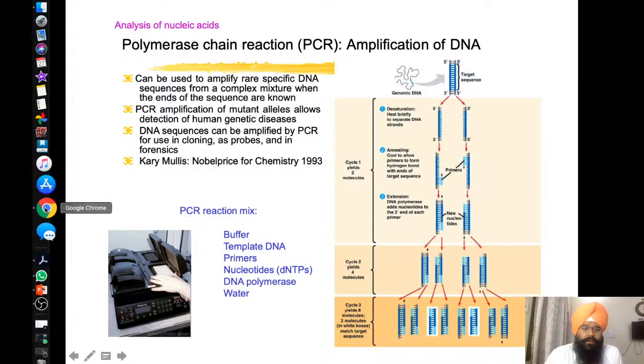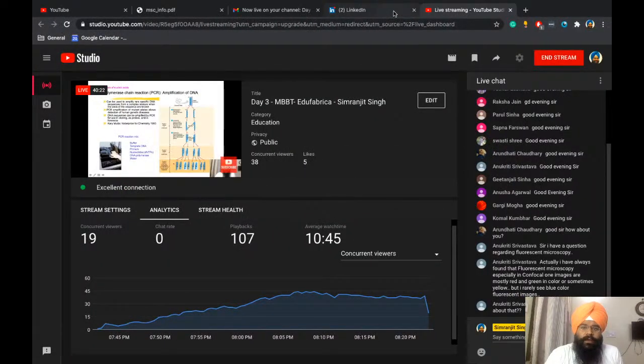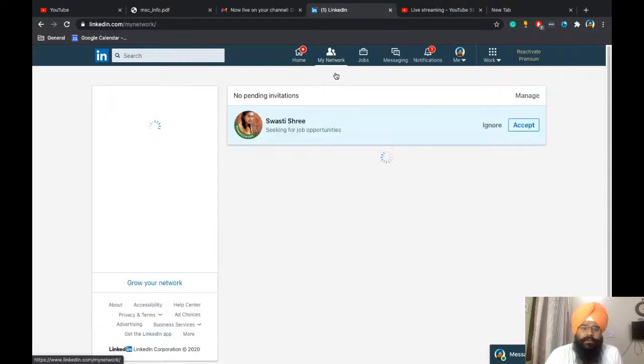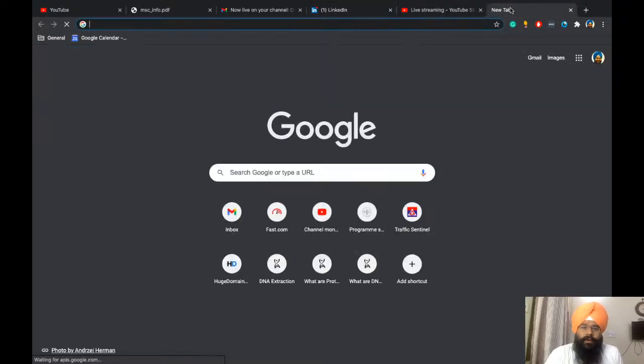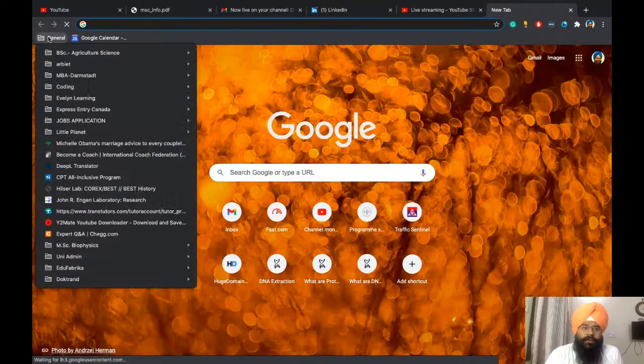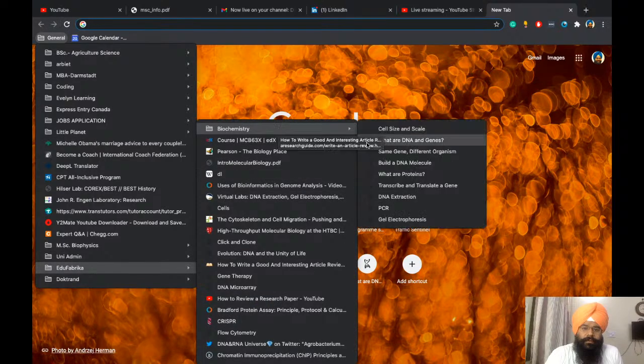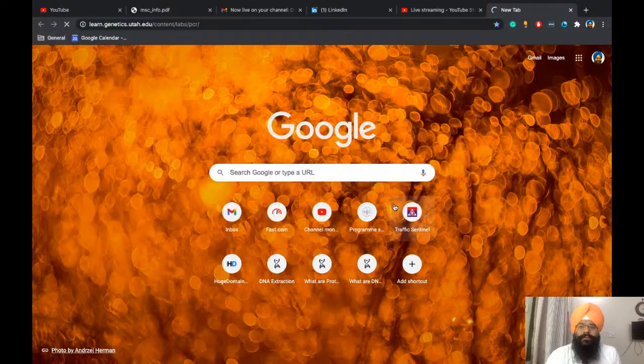So to start with further, let's go for one virtual lab of PCR.